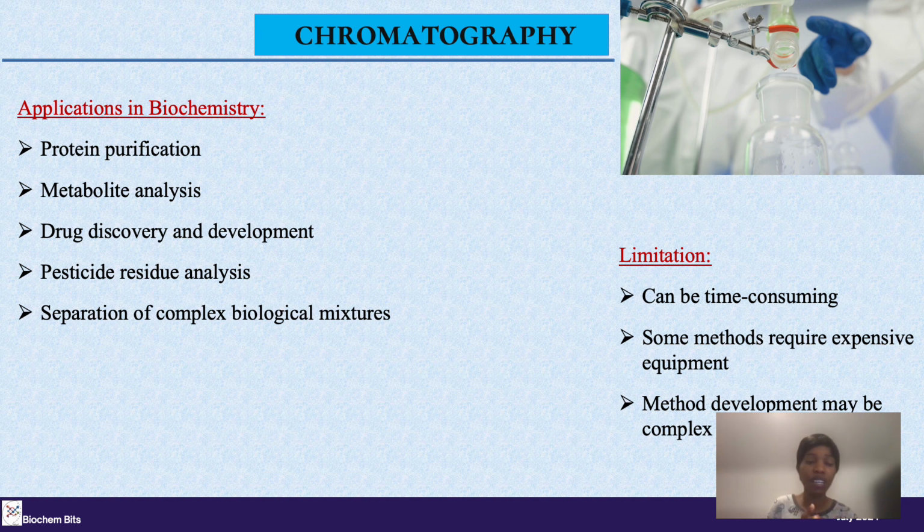And in protein purification, chromatography has been applied. It has also been applied in drug discovery and development, where you're able to identify the active components or active ingredients in a particular sample and then be able to narrow it down and separate some complex biological components. But some of the disadvantages or limitations to this technique is that it takes more time and can be quite expensive.